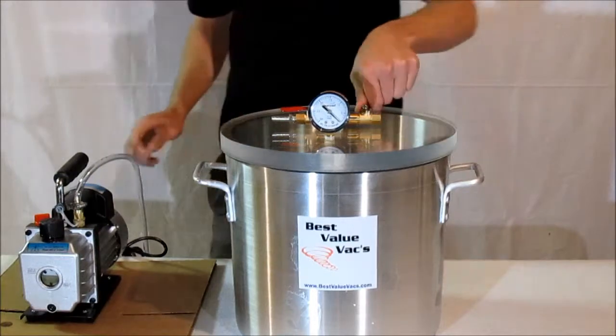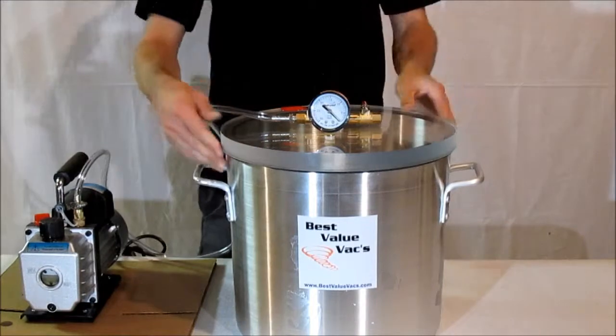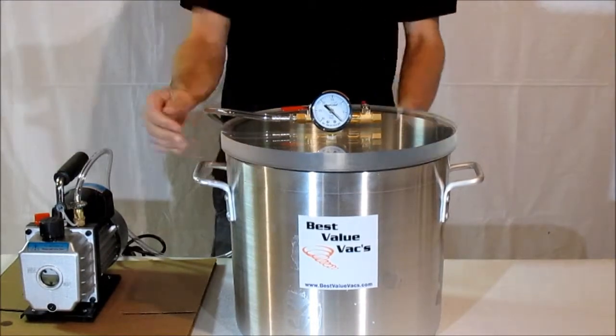Place the two valves together, close the appropriate valve, connect your vacuum hose, and turn on your pump.